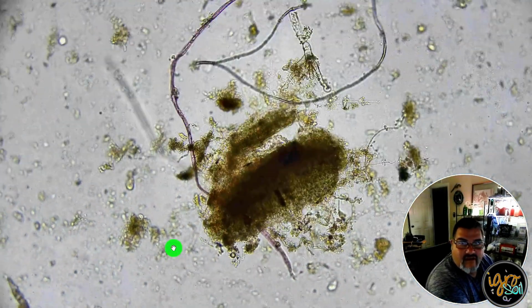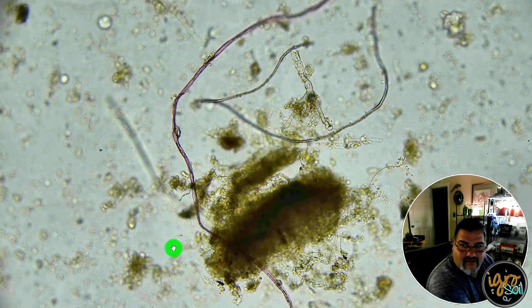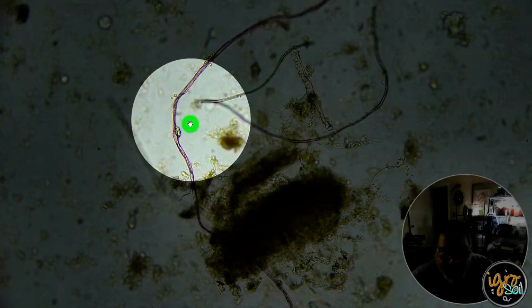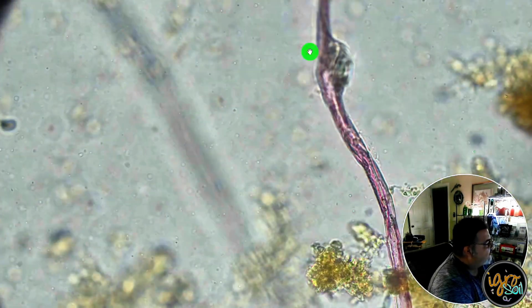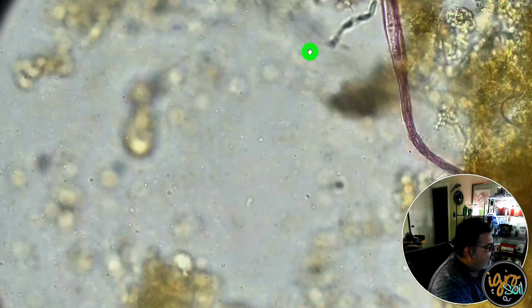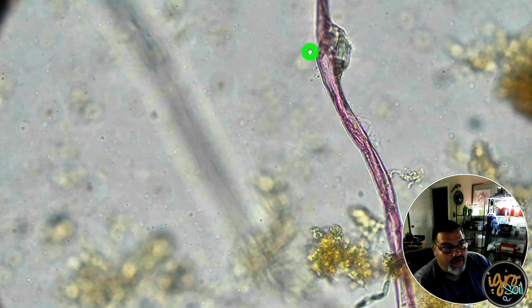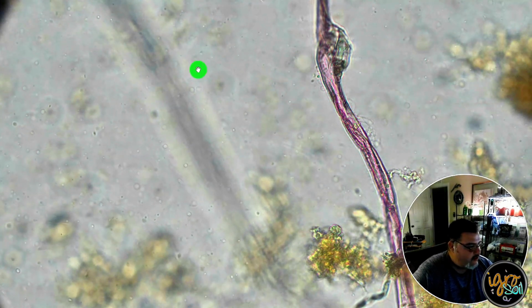This is without a doubt microplastic. You see this? First of all, it's red. So it could have been from a bag. Right? Let's go 400. This is another thing we're researching right now and we're trying to figure out, but I'm trying to think what could have been red. You know what? The top of the tote is red. So maybe when I go in there with my shovel and whatever I do, I'm scratching it.